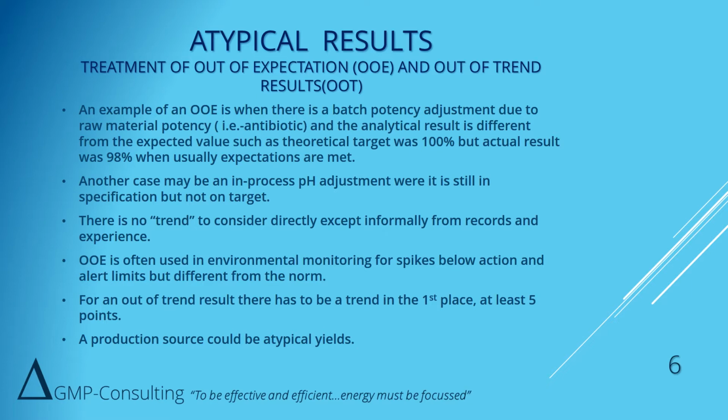Another case may be a pH adjustment. Again, you've made a pH adjustment to an injectable bulk product, and it's not where you expected it to be. There's no trend to consider, so it's not actually out of trend. And you might get them in environmental monitoring as well.